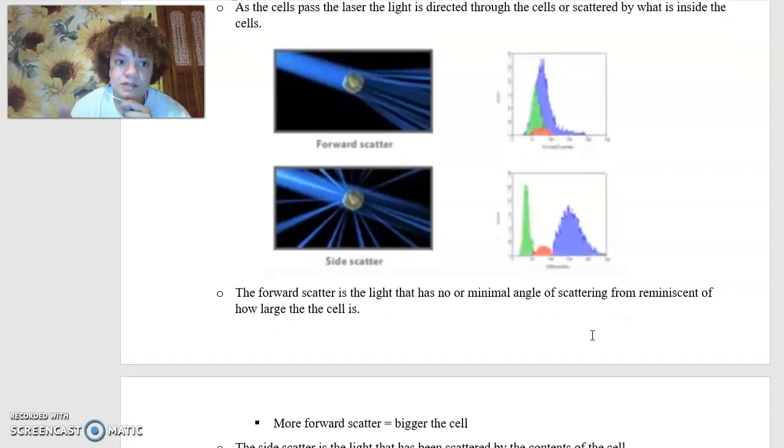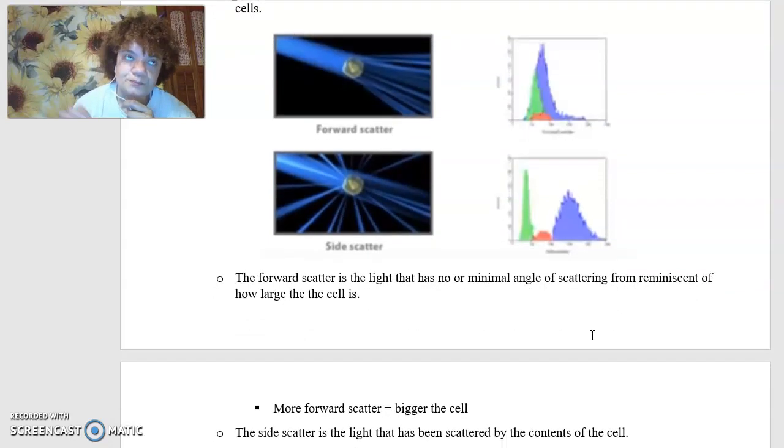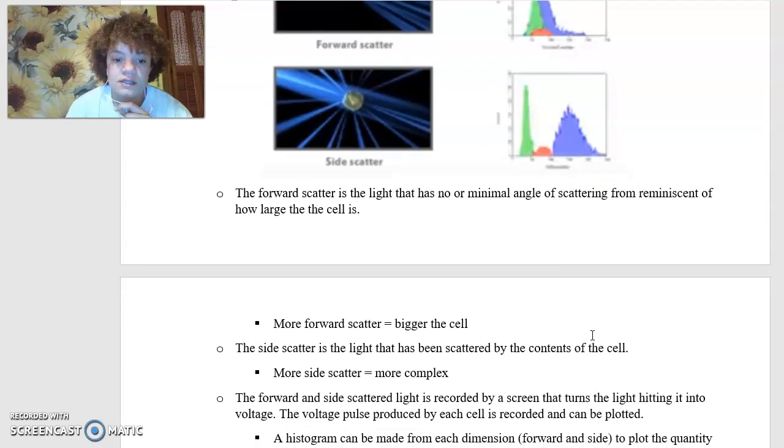So these data points that I've been talking about: when the laser passes through, there is a photoreceptor on the other side of the wall. It's not measuring the light of the laser itself, but what's scattered. There's something to stop the laser itself, so it's only measuring the scatter. The photoreactive sensor measures the photons that hit the sensor and turns them into voltage. Every time a photon pings against the sensor, it sends an electrical impulse, and that's what the computer reads.